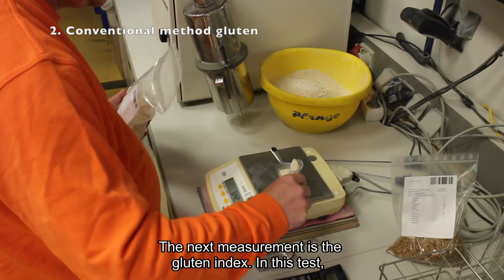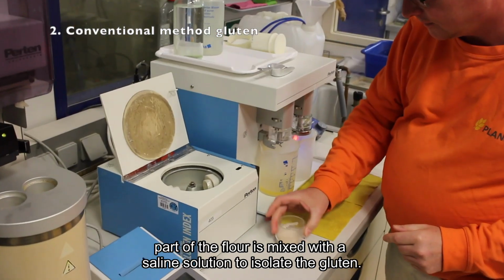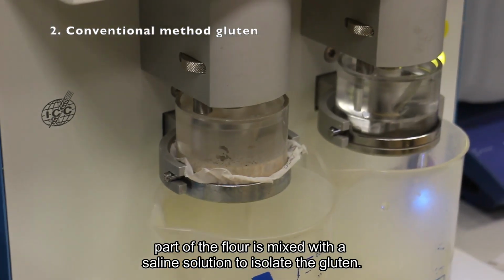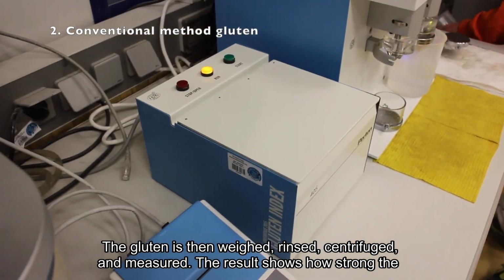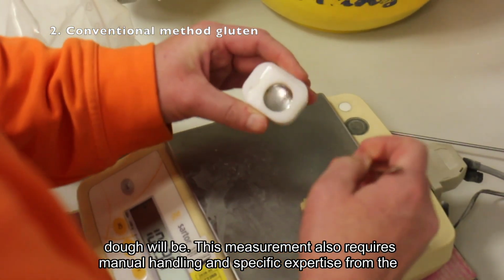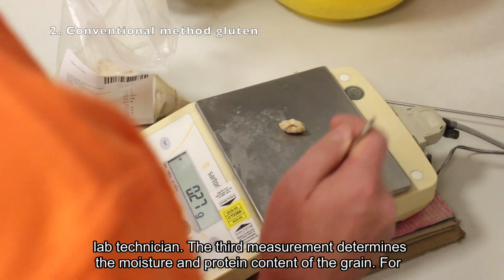The next measurement is the gluten index. In this test, part of the flour is mixed with a saline solution to isolate the gluten. The gluten is then weighed, rinsed, centrifuged, and measured. The result shows how strong the dough will be. This measurement also requires manual handling and specific expertise from the lab technician.